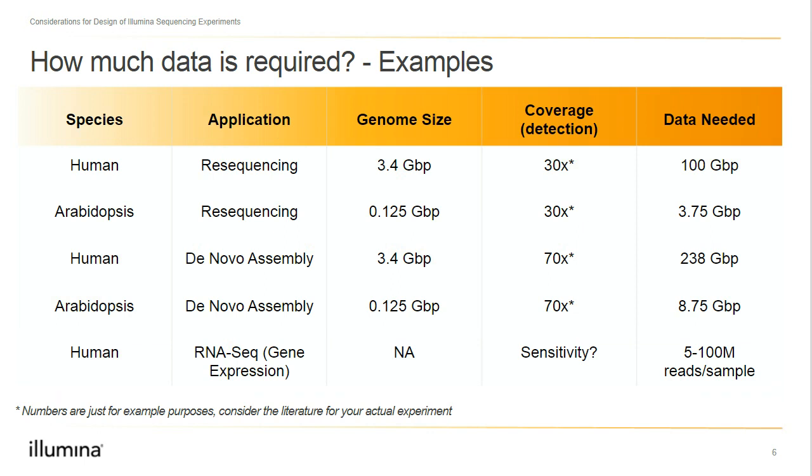You've heard me broadly mention coverage. I'm not going to talk about how to decide what coverage is right for your experiment, but I will link you to our coverage calculator in the resource section of this presentation.